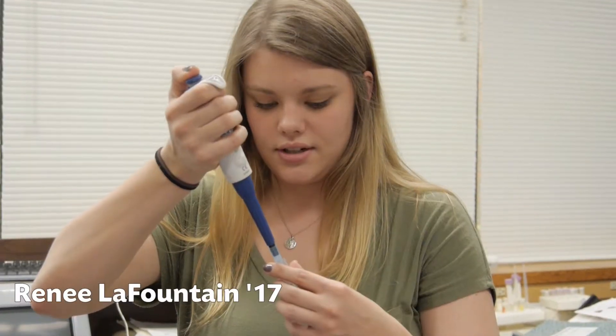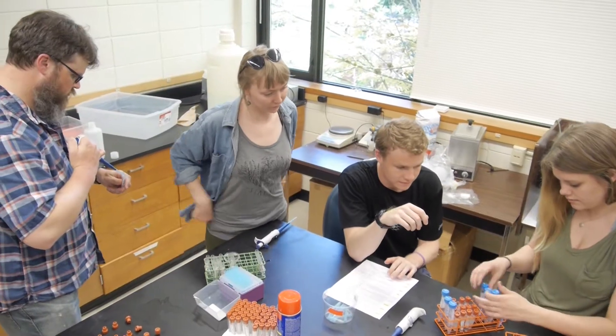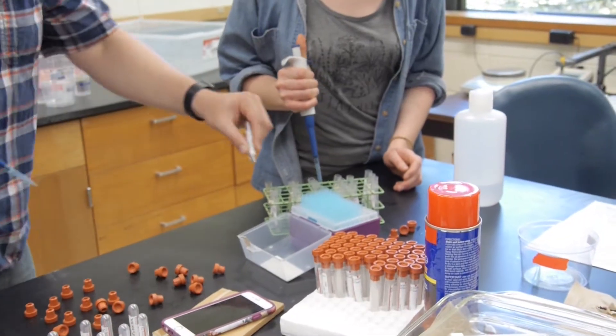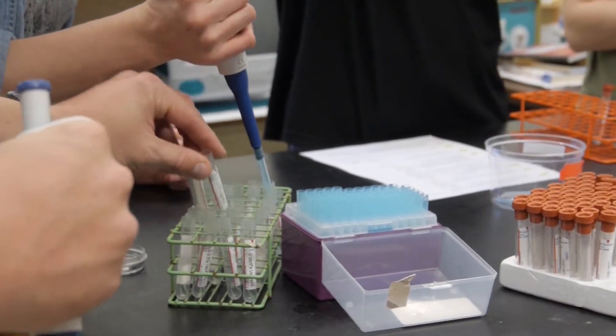A serial dilution is just a series of dilutions where each solution will be more dilute than the last. We're just taking a portion of the previous solution and adding it to the next one.